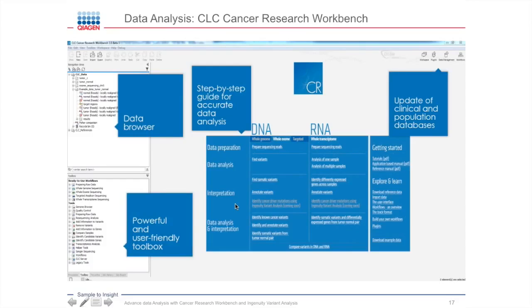So are you at the data preparation step? Are you at the data analysis step? Are you at the interpretation, or are you trying to do workflows that are together? And every one of those links is linking to a tutorial that gives you step-by-step information on how to do the different steps within the tool. On the left side panel, you have your data itself.